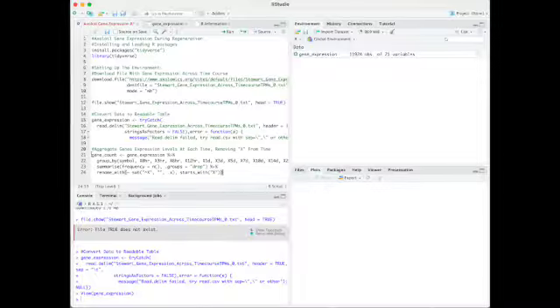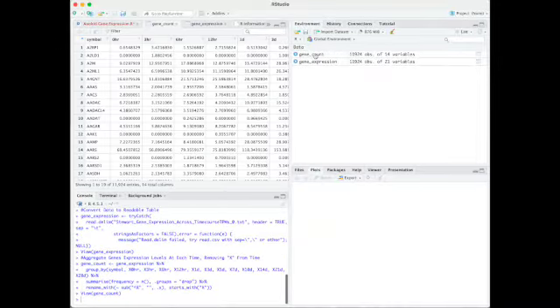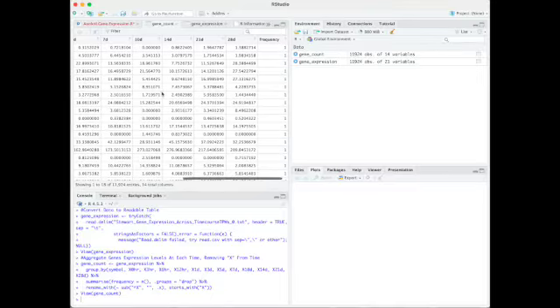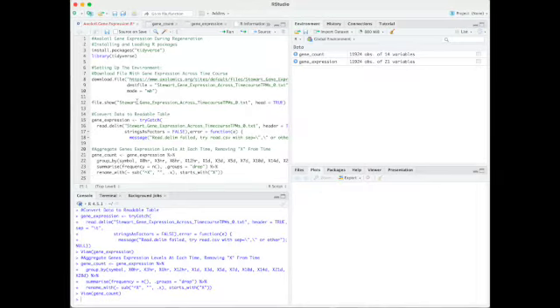Here, using group_by to select the desired data, Symbol was the labeled column with the genes, and the numbers as columns have the gene expression values. I also used rename_with to remove the X in front of the time points. We can now create a new data frame with all the specific genes we are interested in.